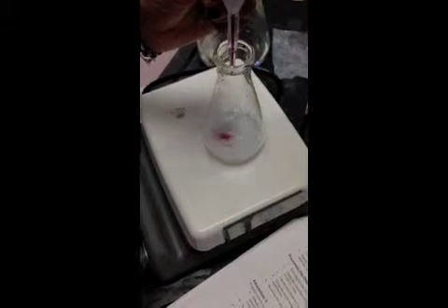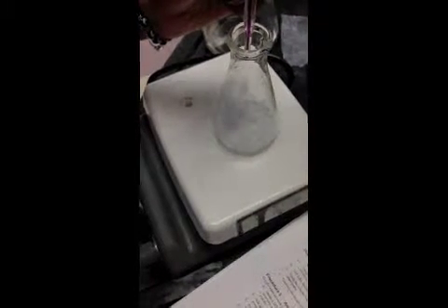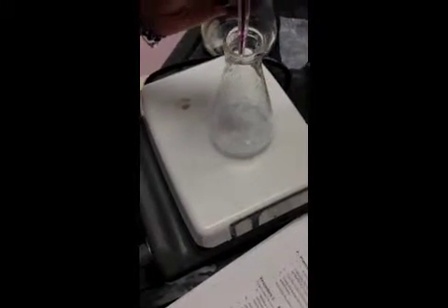Continue to let the potassium permanganate drip through the burette into the solution as needed. It may take a while for the potassium permanganate to have a significant effect on the solution.